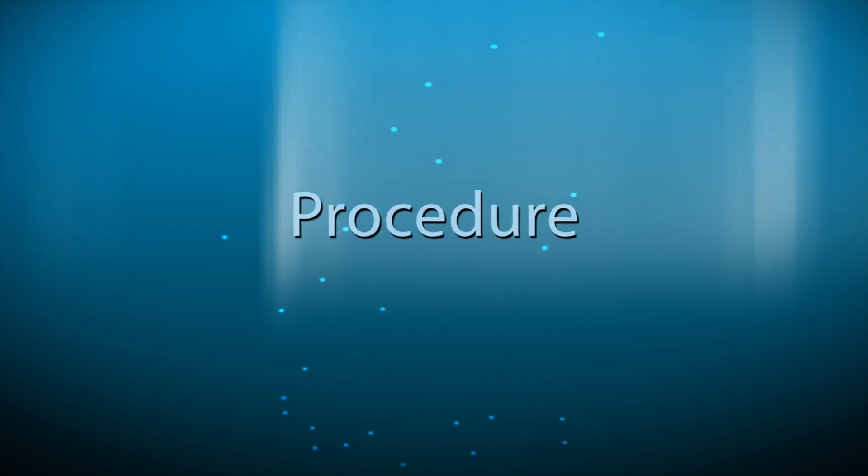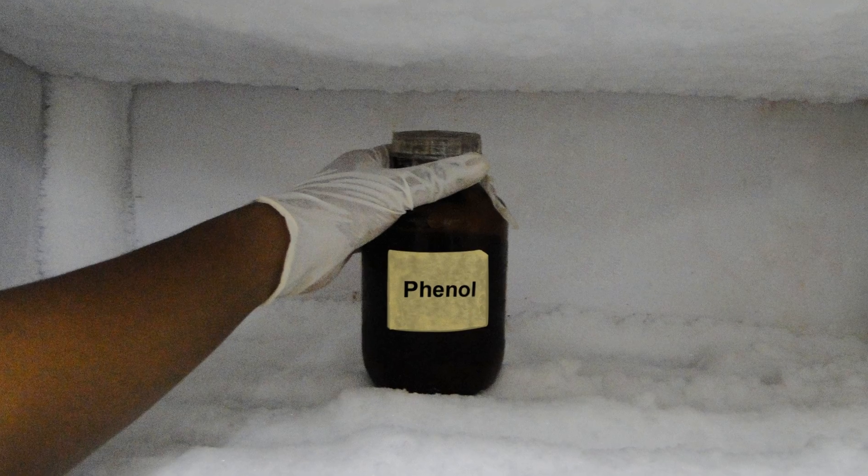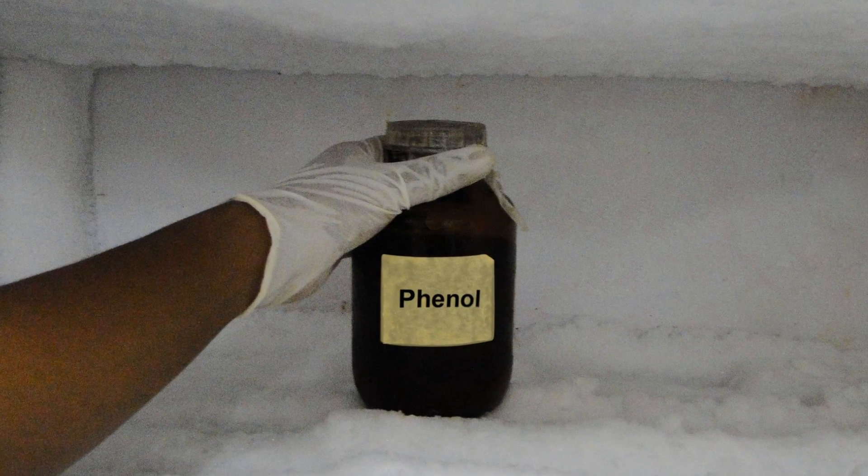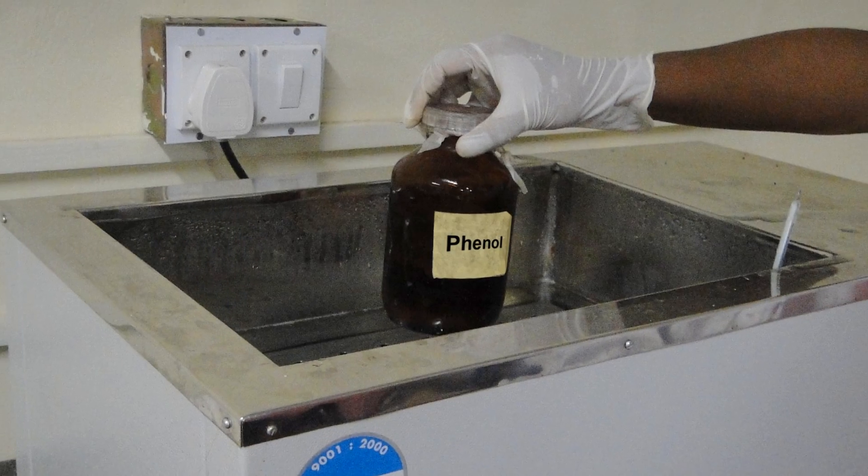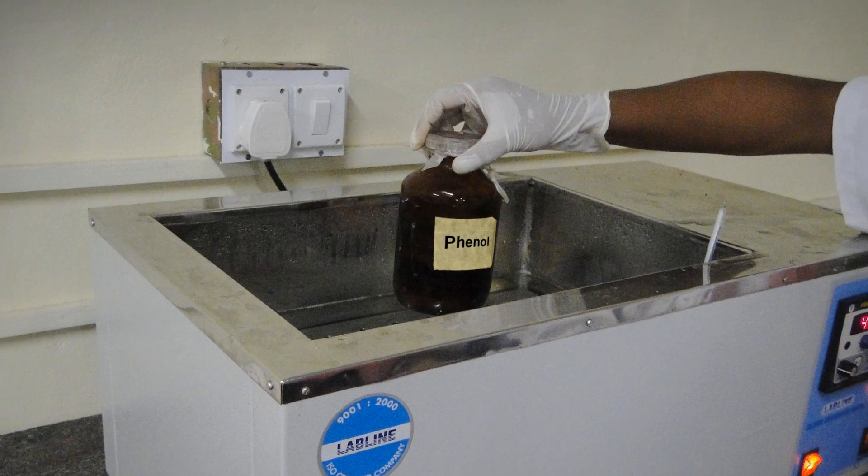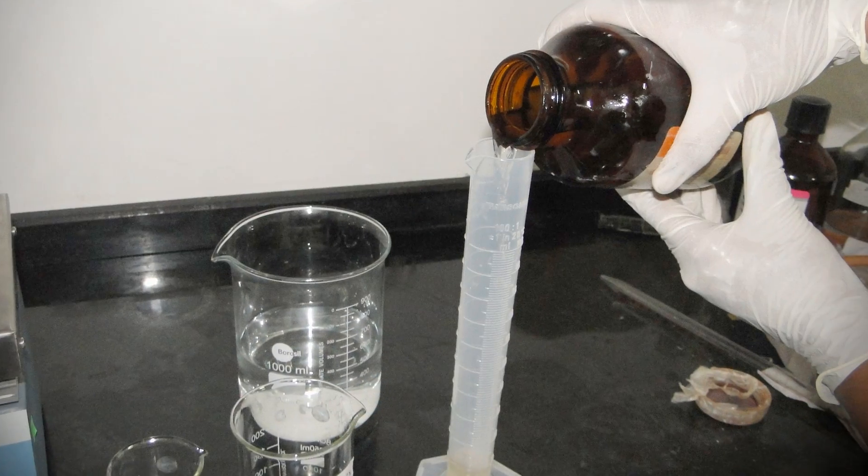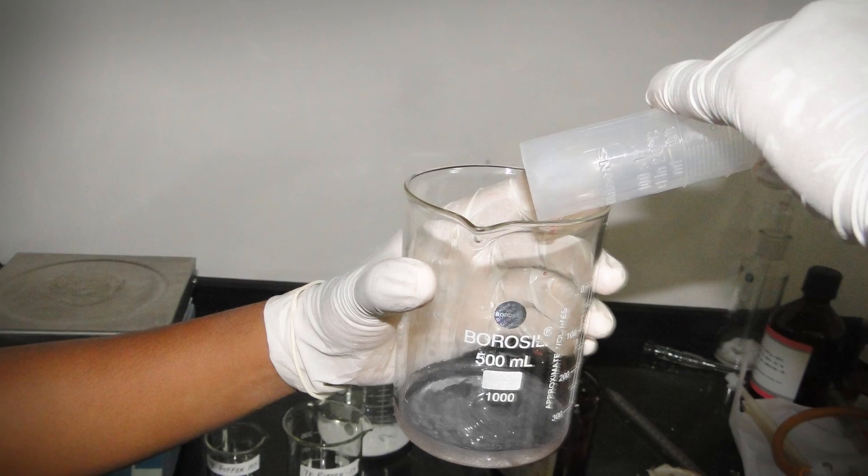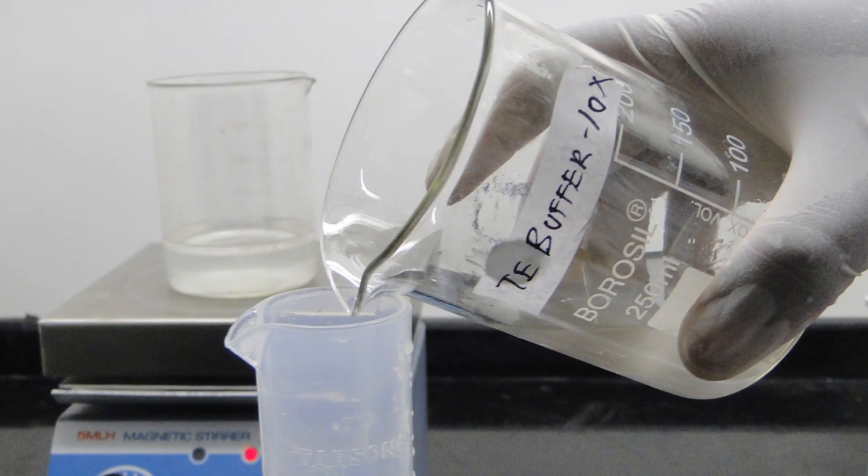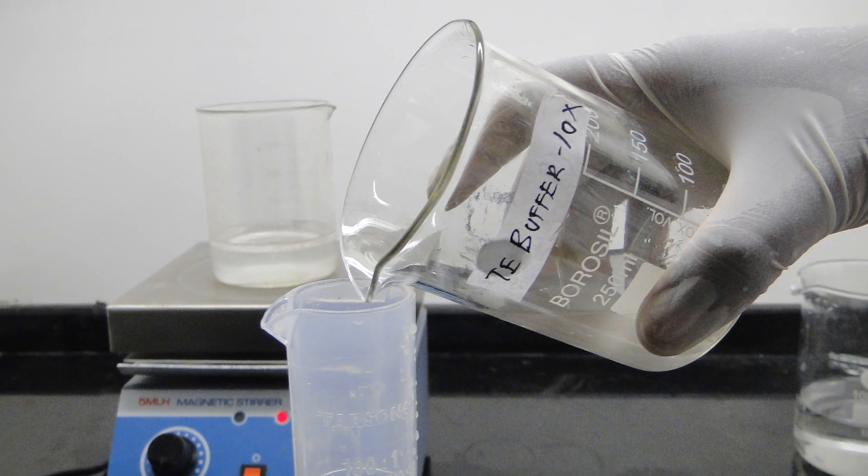The Procedure: Remove the crystalline phenol from the minus 20 degree celsius freezer and thaw it at 60 to 65 degrees celsius in a water bath. Add desired volume of phenol to an appropriate size bottle. Now add an equal volume of 10X TE to the phenol.